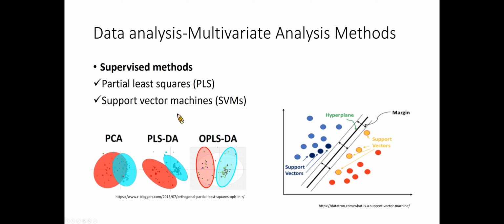Unlike principal component analysis (PCA), PLS components do not maximize the explained dataset variance, but the covariance between the variable of interest and the metabolomic data. Therefore, the feature coefficients or loadings of PLS components represent a measure of how much a feature contributes to the discrimination of the different sample groups. However, one weakness of PLS is that some metabolic features that are not correlated with the variable of interest can influence the results.